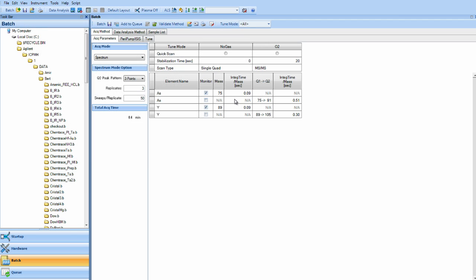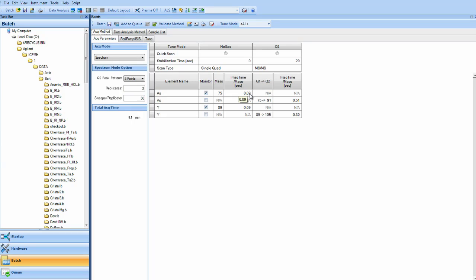Today, however, we're also running some of the interferences that go along with arsenic. Arsenic has an interference with HCl. The interference is argon chloride. We're using liters of argon, and we're going to have chloride that we're spiking into our samples, about 3%.